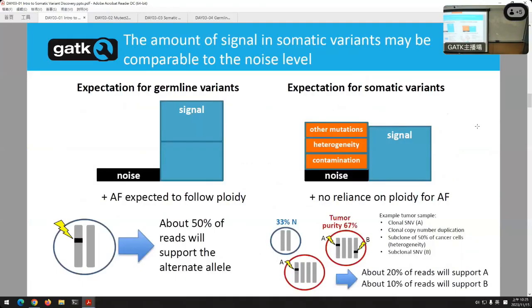I mentioned this on the first day, I'll say it again. When you think of germline variants, the stuff we've been doing for the last 2 days, well, we know there's noise. We talked about all the filtering we've had to do because there's contamination, or the sequencing isn't perfect, or the human reference is not perfect, or your reads are short. So there is noise on the germline side, but there's a lot more noise when it comes to cancer.